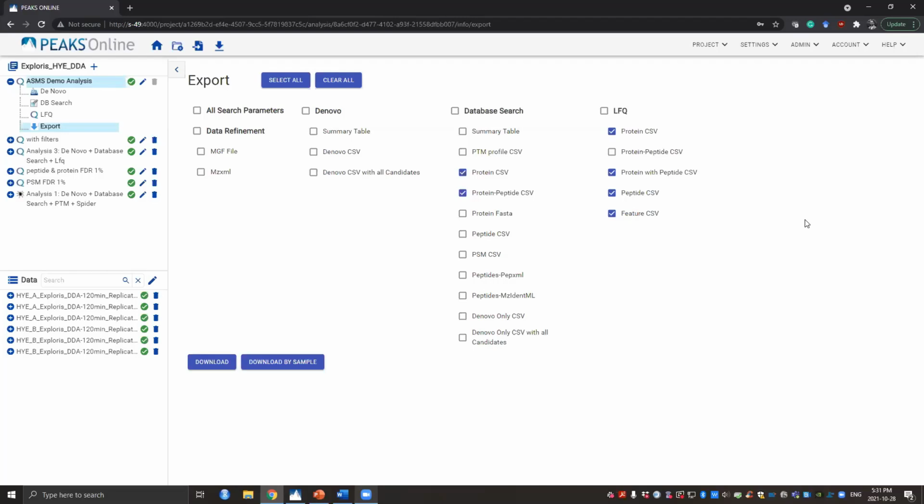So it would be a slight difference in the score, but the similarity in the sequence across the rest of the peptide should be quite similar. For most peptides, it won't change whether or not the peptide passes or fails the false discovery rate. So it should have a minor effect, but it shouldn't have a huge effect on your results.